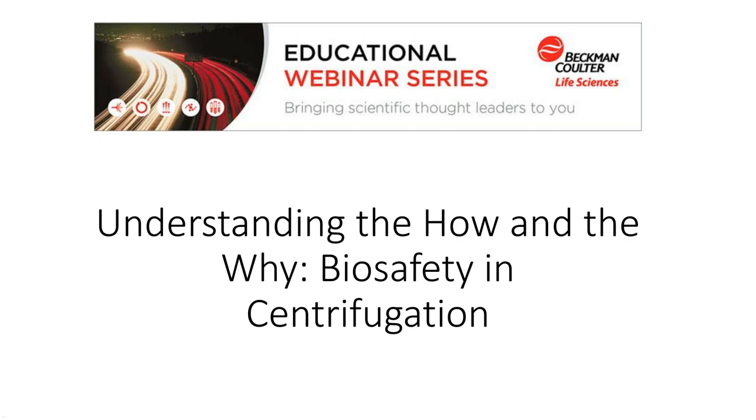Okay, thank you. Next question. Do rotors need to be replaced even with no signs of damage? And if so, how often? Good question.